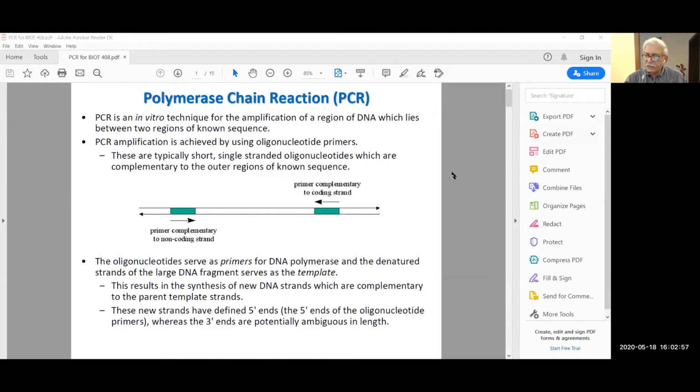But I have seen in my experience that if we take directly the RNA as a template, we can still get some amplification. Okay? If the quantity of the total RNA is good and the RNA is not degraded initially, you can try actually to PCR amplify from RNA, okay? It works, but it does not work as good as a DNA molecule.